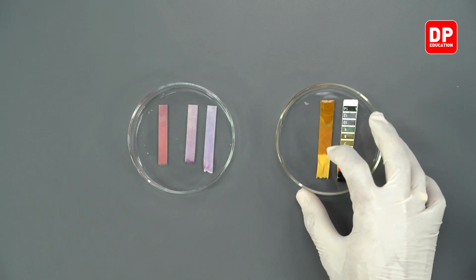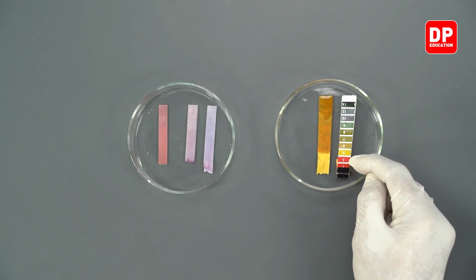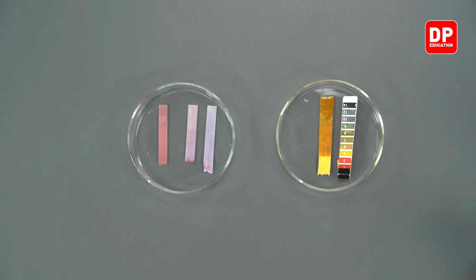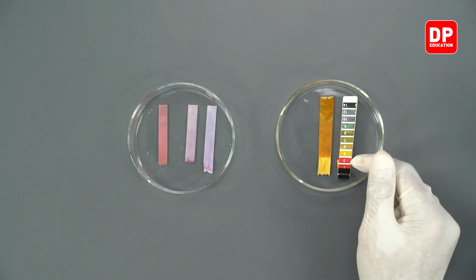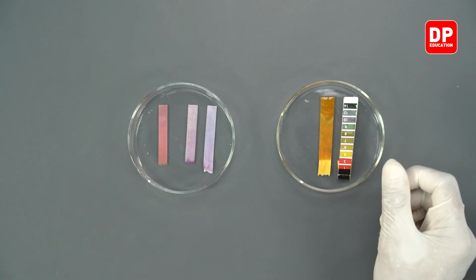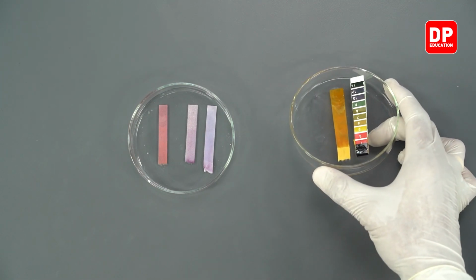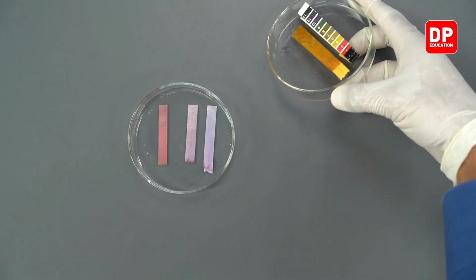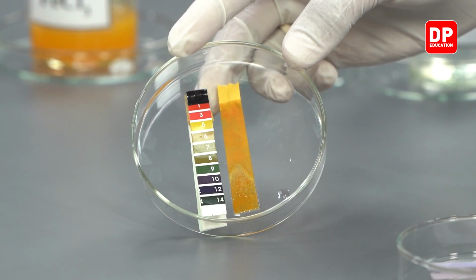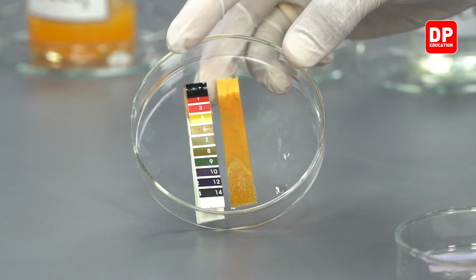It is an orange color between yellow that you observe here and red here, which means the pH of this phenol solution is somewhere between pH 3 and pH 5. This is not red and this is not yellow. It is between red and yellow, which means the pH of the phenol solution we have is between pH 3 and pH 5.